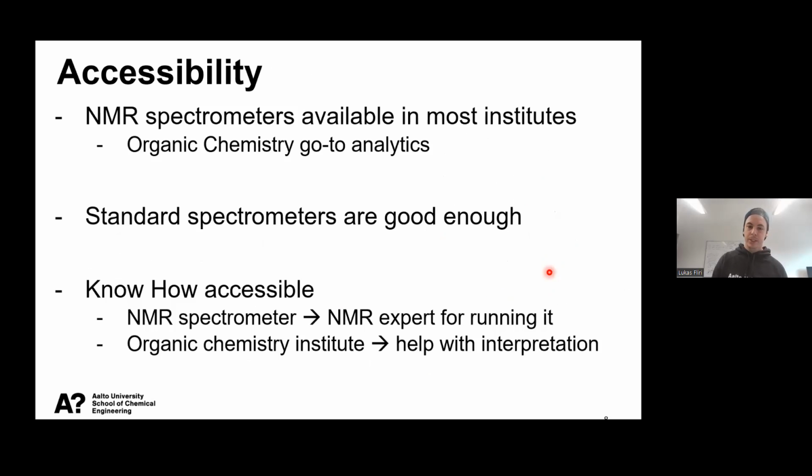Another point I want to highlight of this NMR method, or of solution state NMR in general, is the accessibility of solution state NMR. I'm not pushing a method that needs some synchrotron or some super specialized equipment.